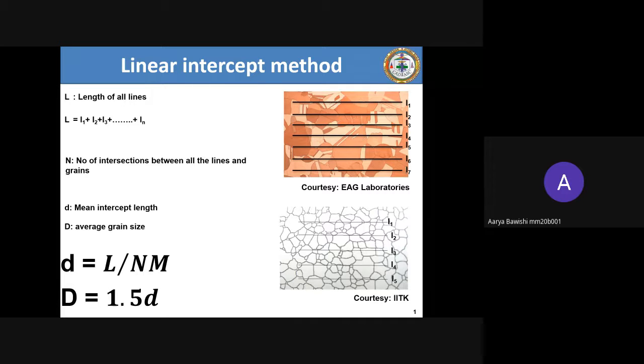Four of them were 37.922, and the last one was 37.792. Okay. And that line was passing through the entire image, from left to right, properly? Yes. Then how come the last line was so short? I just drew it so it touched the end. There was no problem with that. Even the angle was the same, and the max came out to be the same in all the cases.